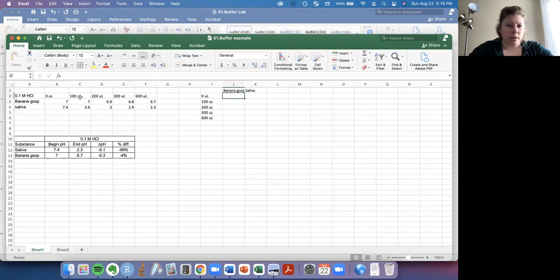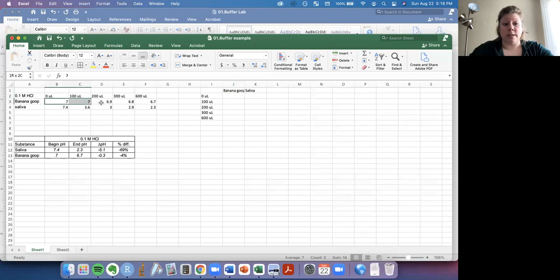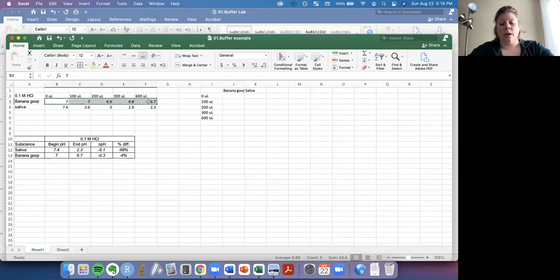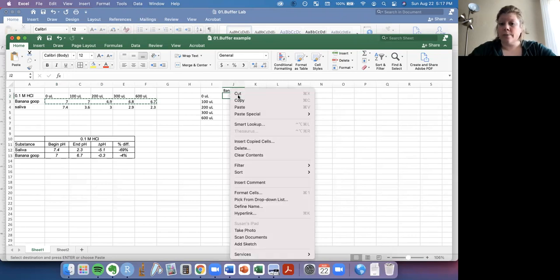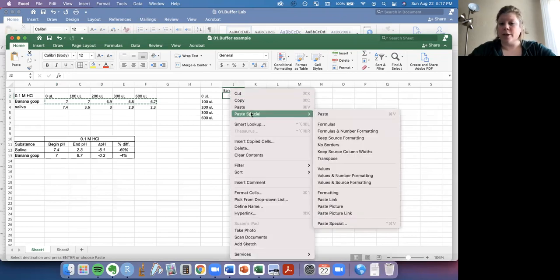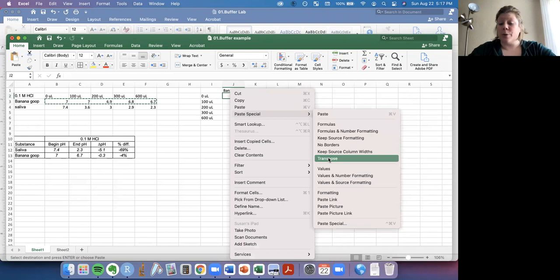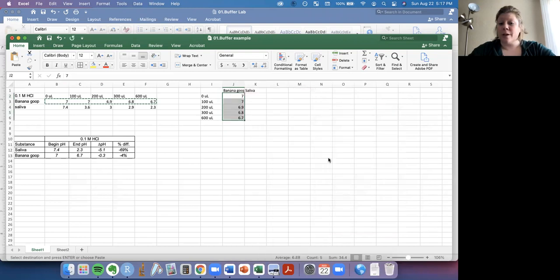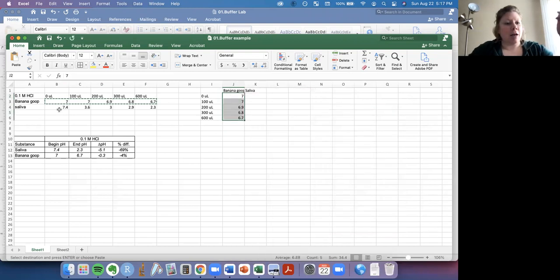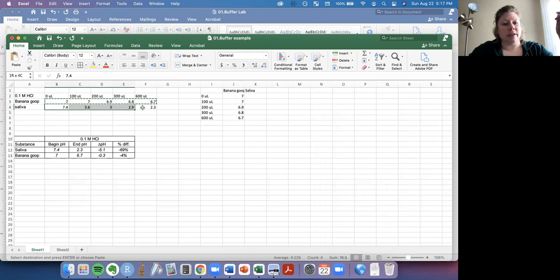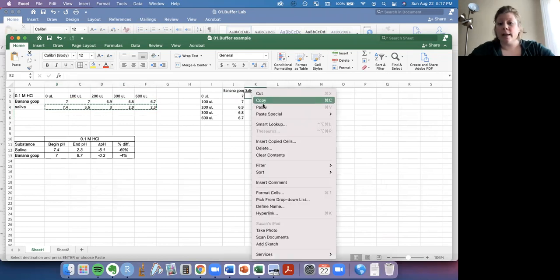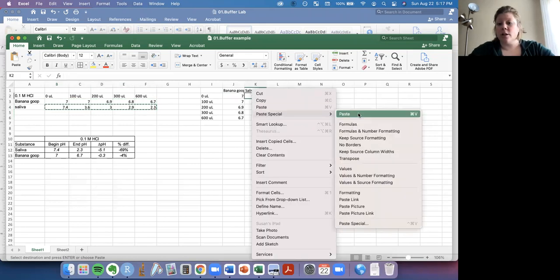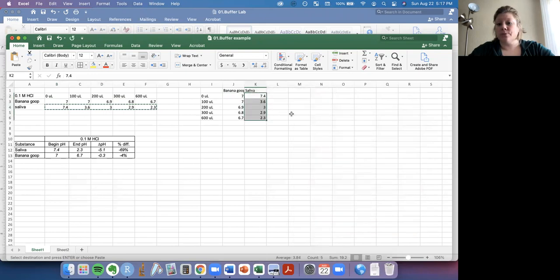And then I'm actually going to take my numbers from banana goop and copy them. And then here I'm going to right click and paste special. I want to transpose the values. Bam. Look at that. We can do that with the saliva group as well. Copy. Right click and paste special. Transpose.